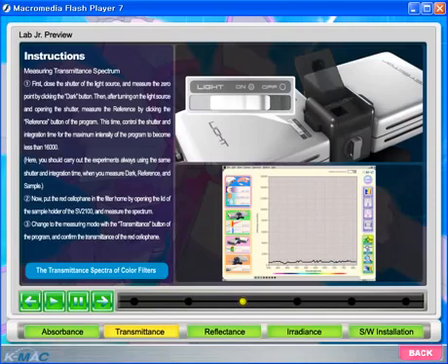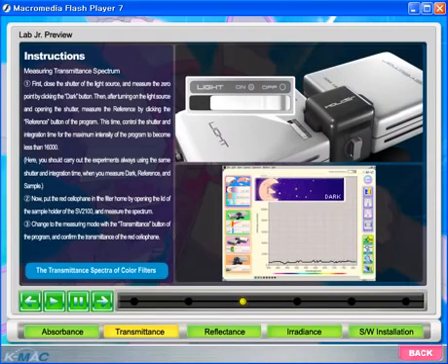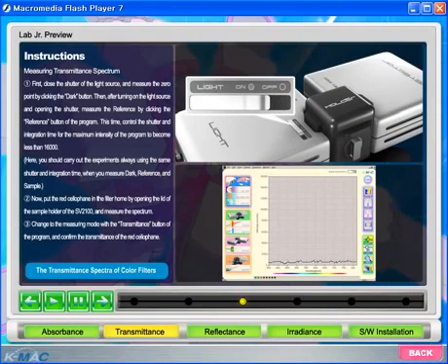First, close the shutter of the light source and measure the 0 point by clicking the dark button. Then, after turning on the light source and opening the shutter, measure the reference by clicking the reference button of the program. This time, control the shutter and integration time for the maximum intensity of the program to become less than 16,000. Here, you should carry out the experiment always using the same shutter and integration time when you measure dark, reference, and sample.